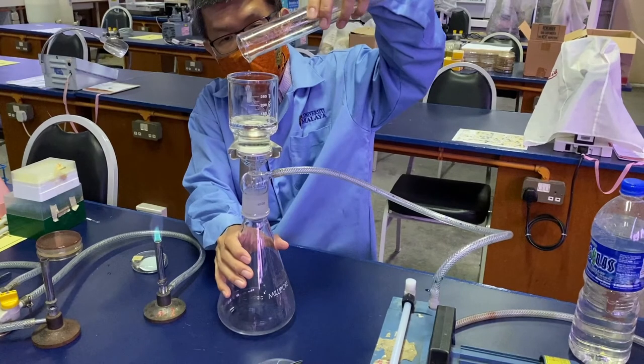The funnel can also be autoclaved and should be autoclaved to make it sterile before use.